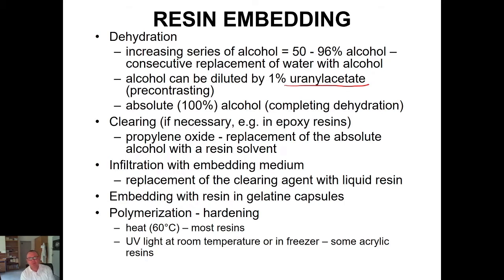The tissue in this block is usually just a very small piece, about 1-2 cubic millimeters in size, because during the procedure we use high molecular fixatives like glutaraldehyde or osmic acid, and the penetration of these solutions is not as fast as the penetration of very simple formaldehyde, for example.